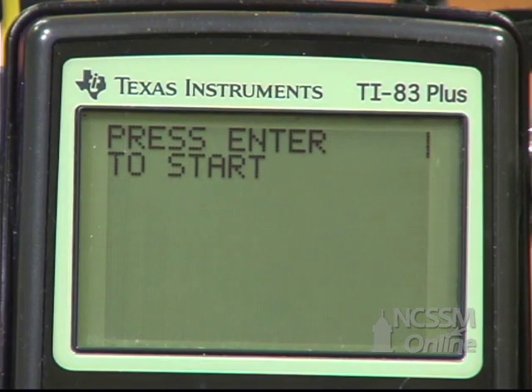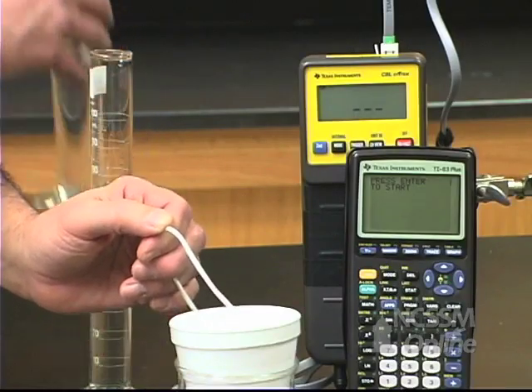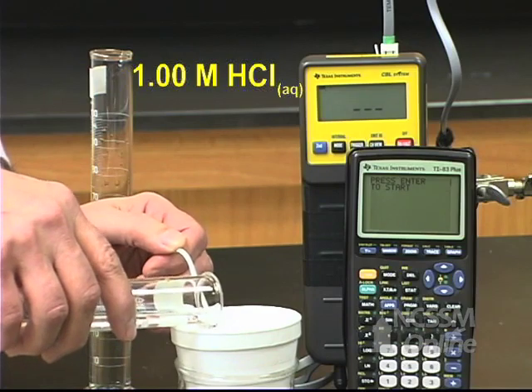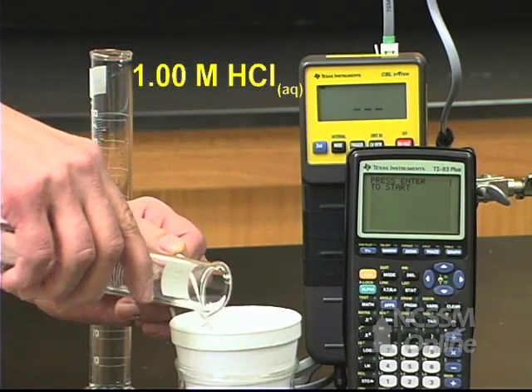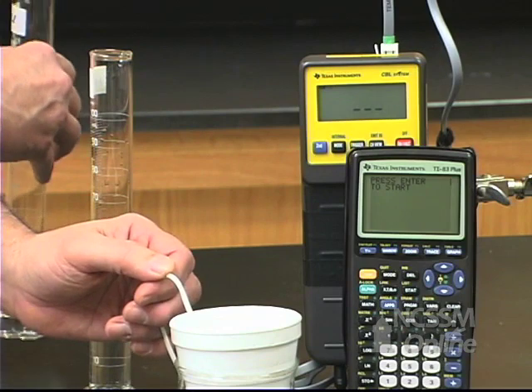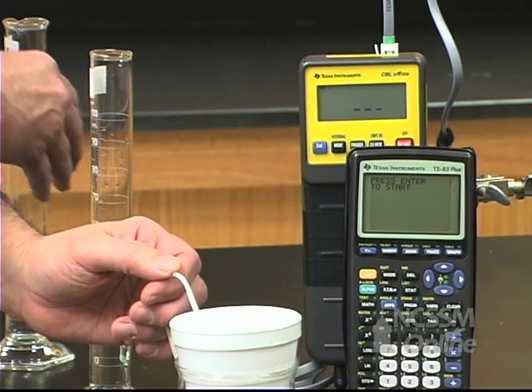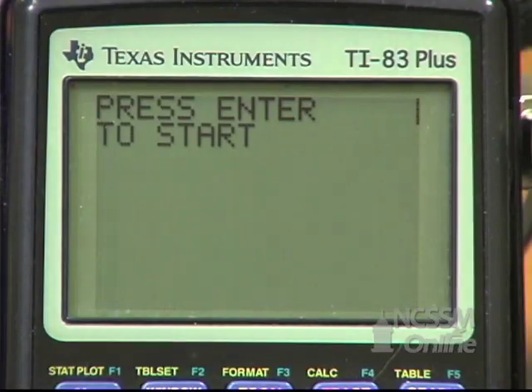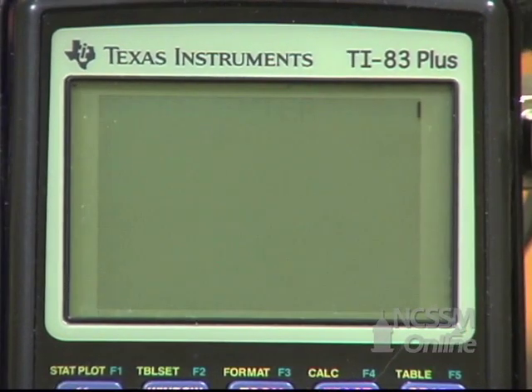What we're going to do is put your HCl solution into the calorimeter. Put the probe in the calorimeter. Make sure that the tip of the probe is underneath the solution. Press enter on the calculator.